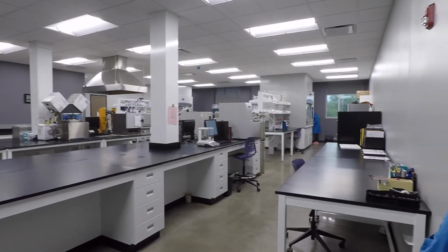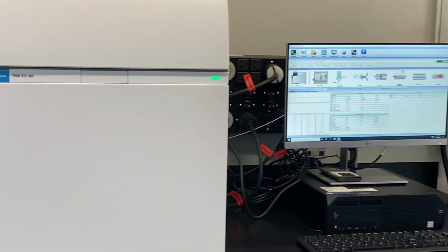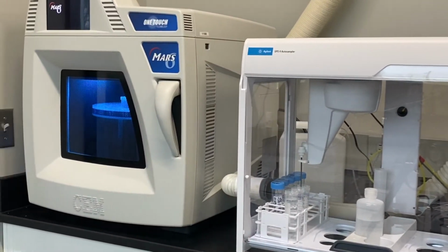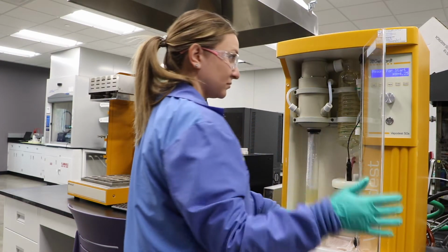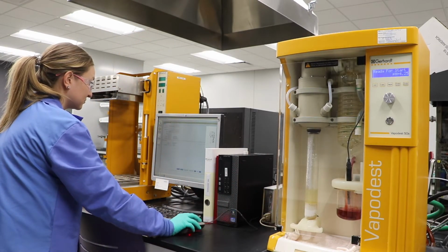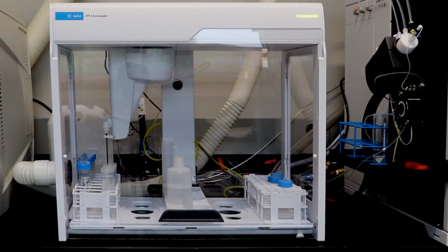The KDA Feed and Fertilizer Laboratory tests samples for the dairy and feed and the pesticide and fertilizer programs, providing test results in a timely manner to safeguard animal and plant health. We routinely examine animal feeds for drugs and antibiotics, including medicated feeds, to ensure they contain a level of medication that matches the product label. We also test for cross-contamination by feed additives or medications.